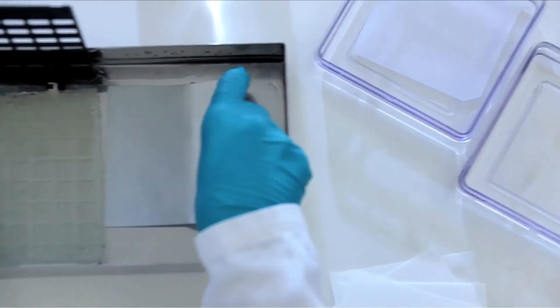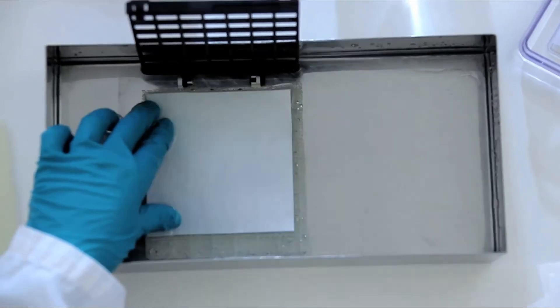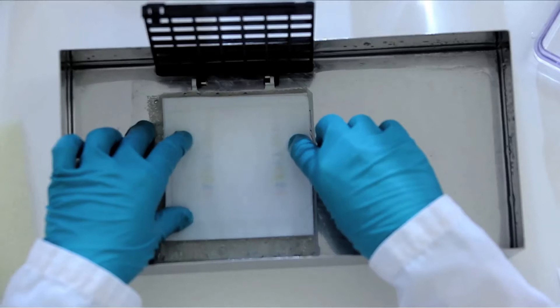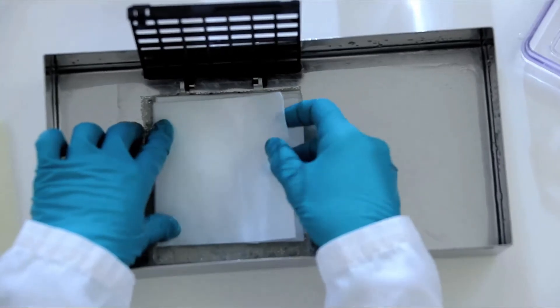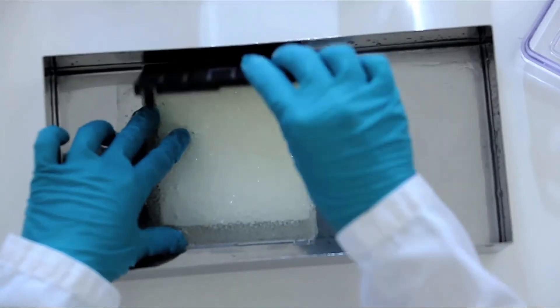Build the sandwich carefully, using two papers pre-wetted in transfer buffer on each side of the gel and membrane. It is important to remove all air bubbles from the sandwich. Carefully use a roller or a cut-down pipette or glass rod to squeeze them out.